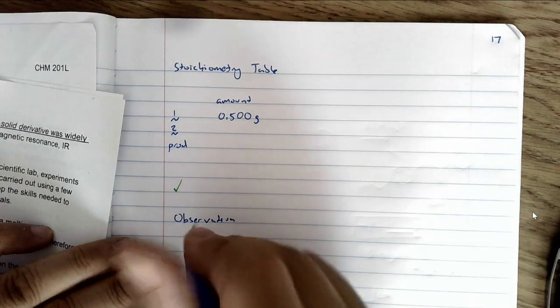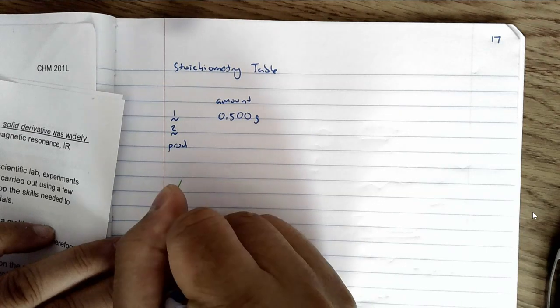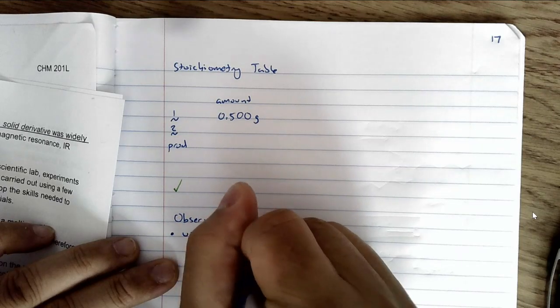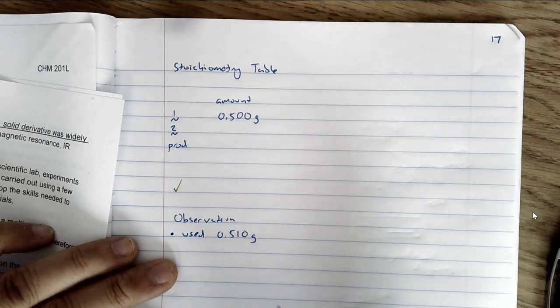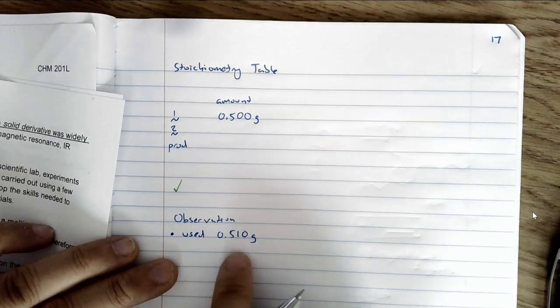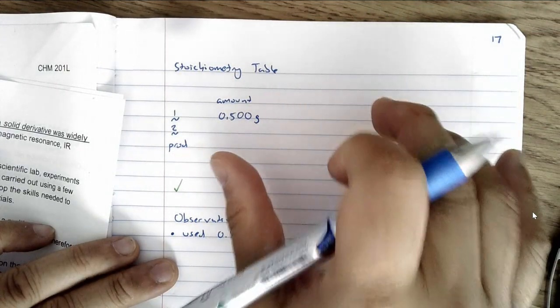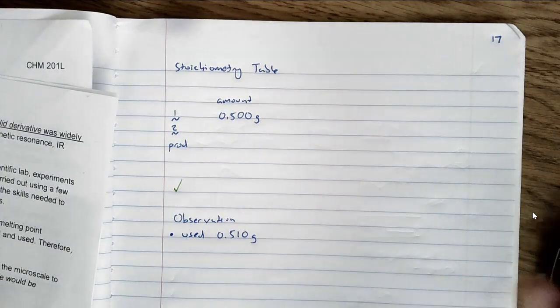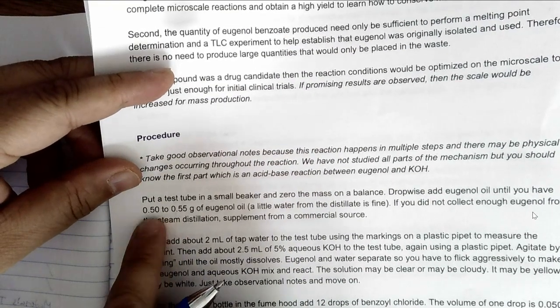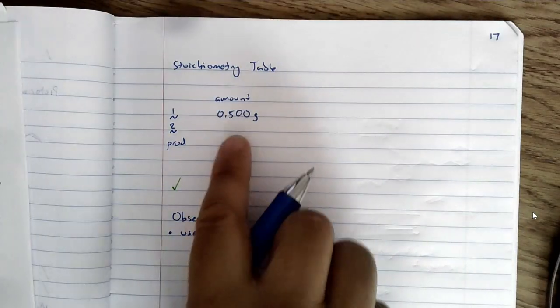Just write in your observations, used 0.510 grams. Okay? And that way, yes, you could recalculate later, but we really need to do the calculations before lab so we get a sense of how much product we expect. And so that's based on this number here. I just chose this one. Okay. So that's the amount.